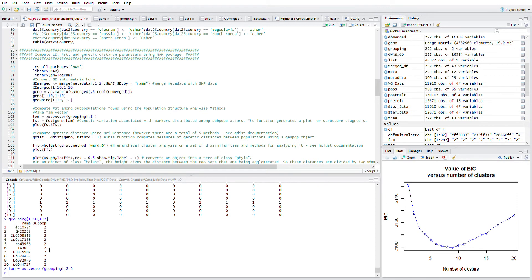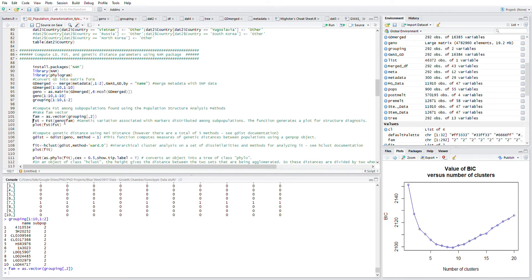First, we want to just create a vector of the subpopulation across the 292 genotypes that we're looking at. We want to bind them together using this FST function, looking at the genetic variation associated with the markers distributed among these subpopulations or clusters.